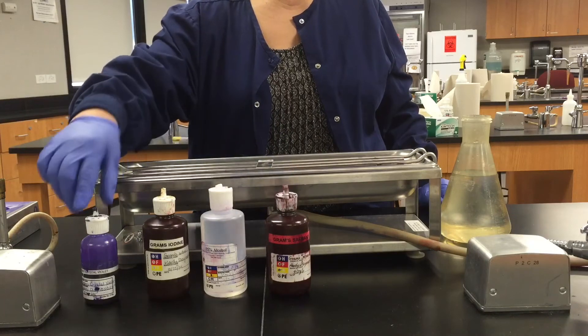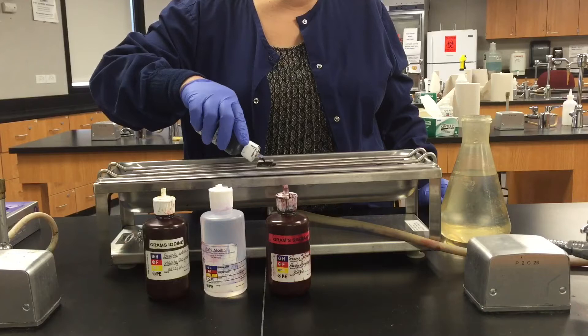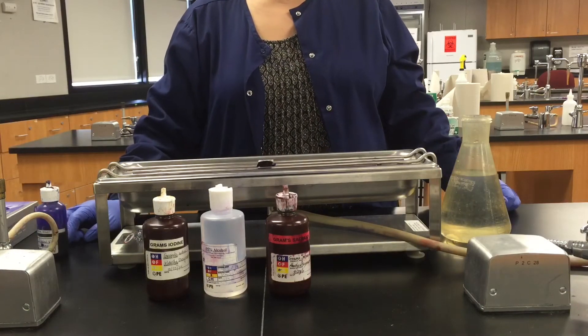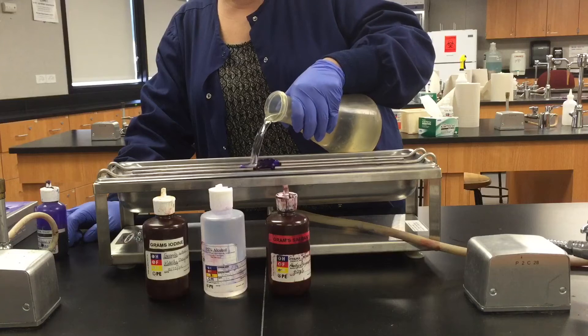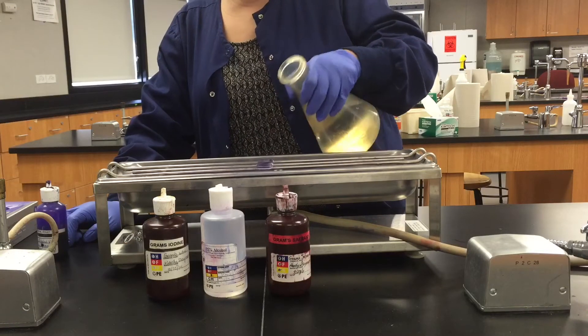After making your air-dried, heat-fixed smear, we're going to cover the slide — the smear — with Gram's Crystal Violet and leave it on there for a minute. After a minute, we're going to go ahead and rinse the Gram's Crystal Violet off, just gently with water.